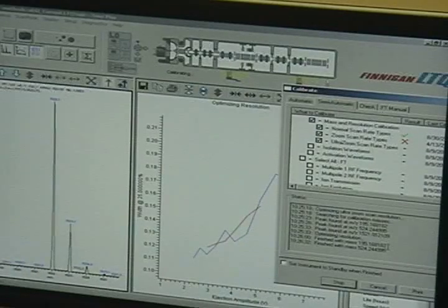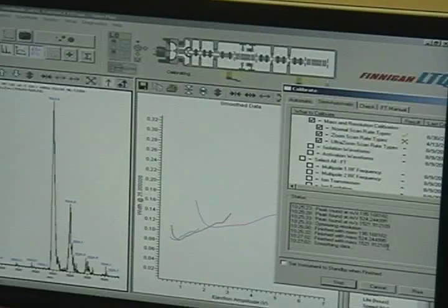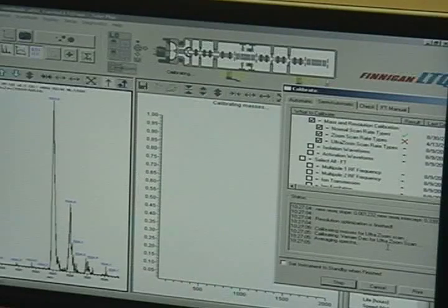So it appears that the charge state screening is not working. I talked to Eric, the other instructor. He was just at Wistar with the spikers. He says it didn't work for them either. So we're trying to collect it.